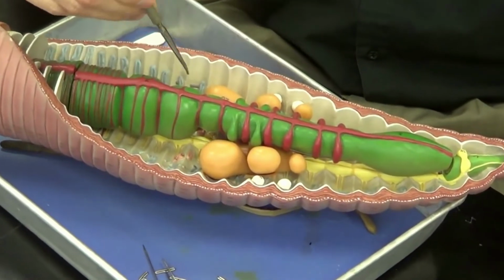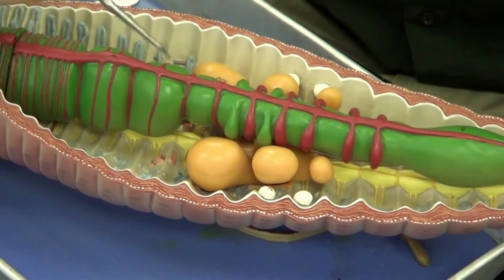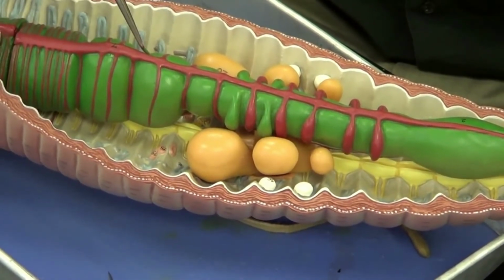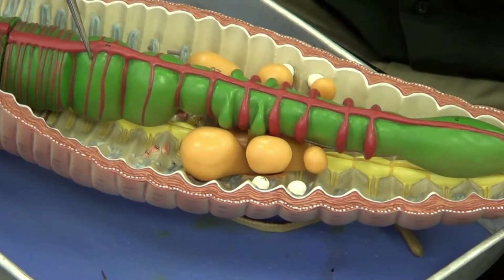until it gets to the crop. The crop is a pouch, a very thin pouch, sort of like a balloon, and it's designed to increase in size because that's where the soil is going to get stored until it makes it to the next phase of digestion called the gizzard.